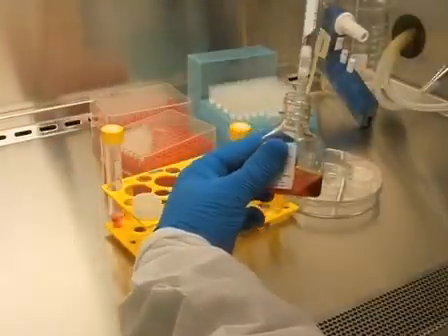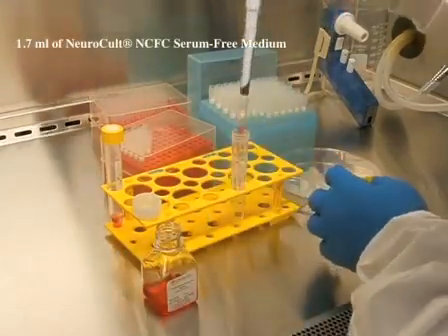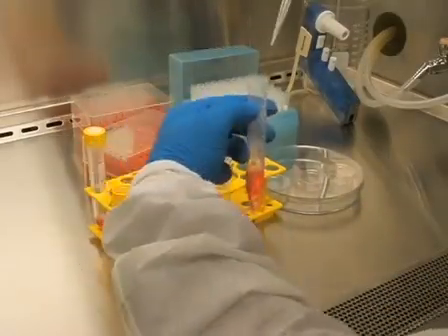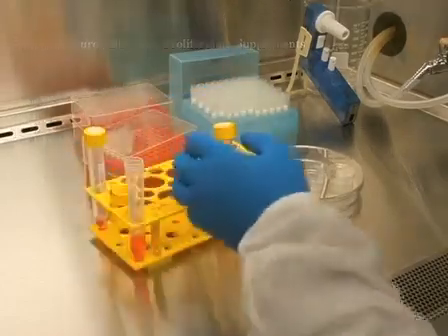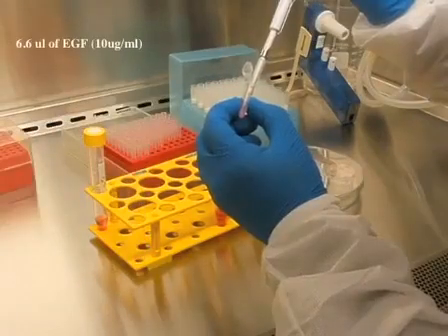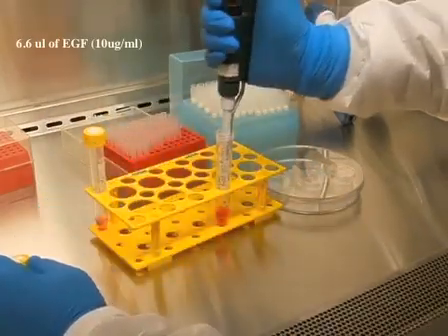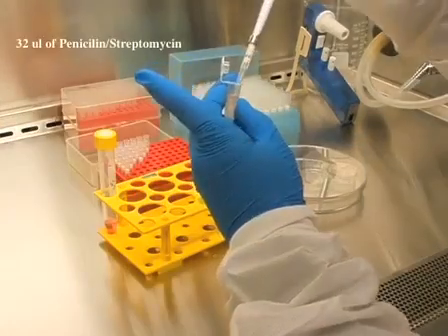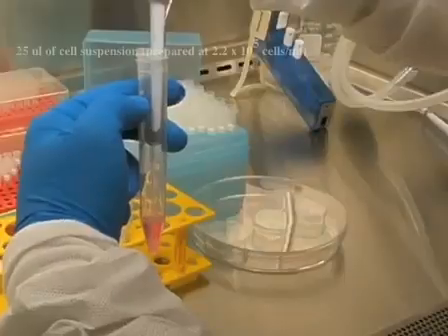To plate cells in duplicate in two 35 mm culture dishes, mix 1.7 ml of NeuroCult Neural-Colony Forming Cell Assay serum-free medium without cytokines with 330 microliters of NeuroCult Neural Stem Cell Proliferation Supplement, then add 6.6 microliters of EGF, and 32 microliters of penicillin streptomycin. Add 25 microliters of cell suspension to the prepared medium.